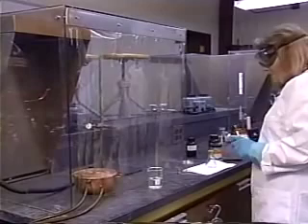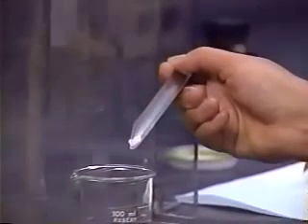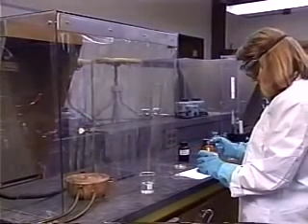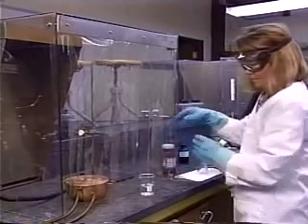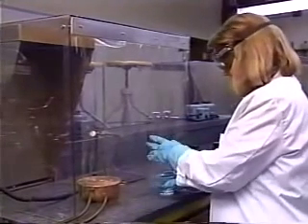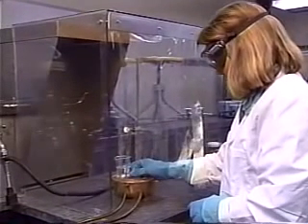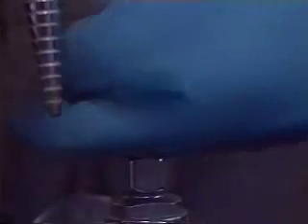Add a boiling chip to some solvent in a beaker and to the Erlenmeyer flask. Boiling chips are small porous stones that contain trapped air, which they release when the solvent is heated. The bubbles of air ensure even boiling of the solution. Heat the solvent, in this case water, on a steam bath. Note that the steam bath is kept warm with only a gentle flow of steam.